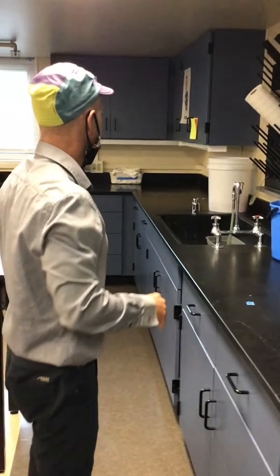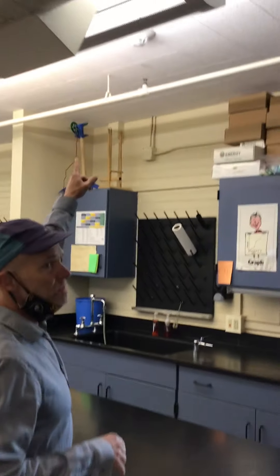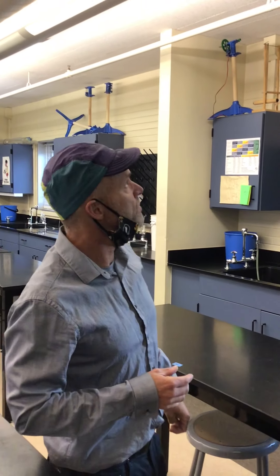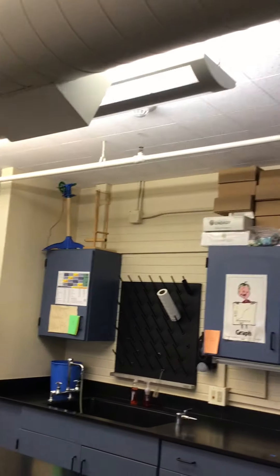We also have the safety blanket, which we saw in the video for fires. We also have these smoke detectors. These are not fire detectors — they're smoke detectors. So if you should do a reaction that generates a lot of smoke and the smoke rises and is detected, it'll set off the fire alarms.